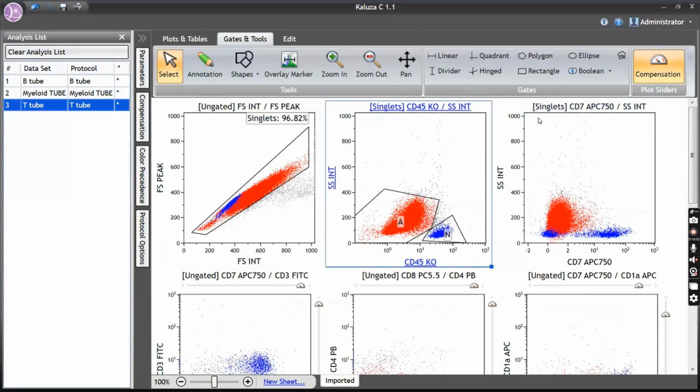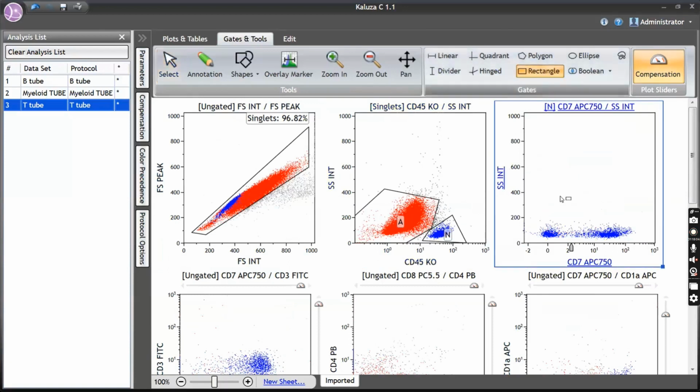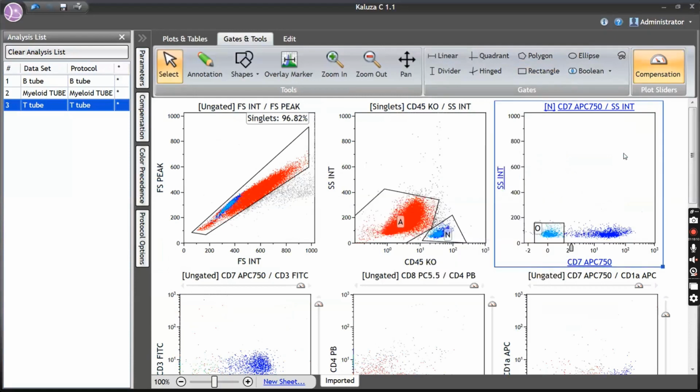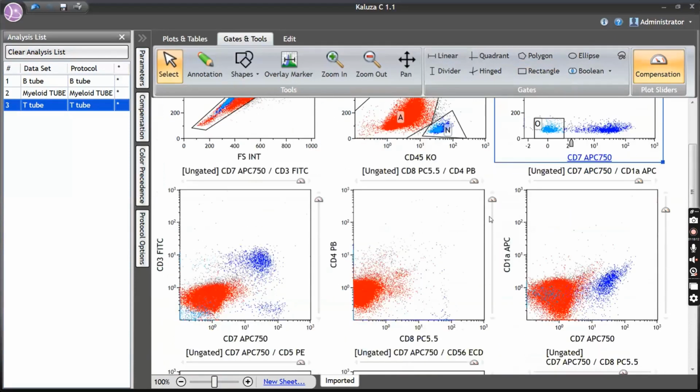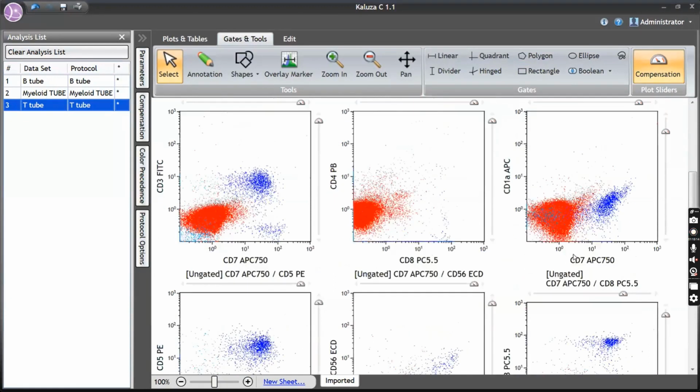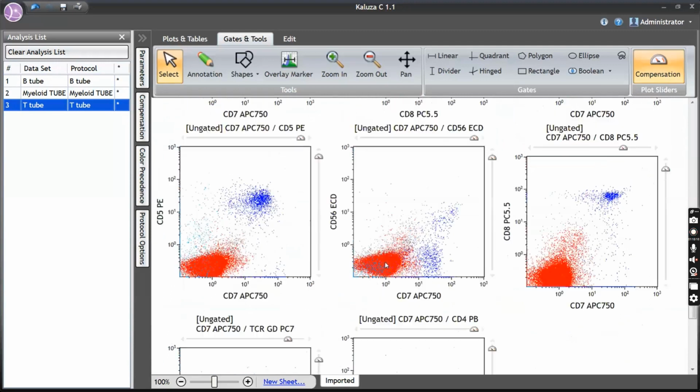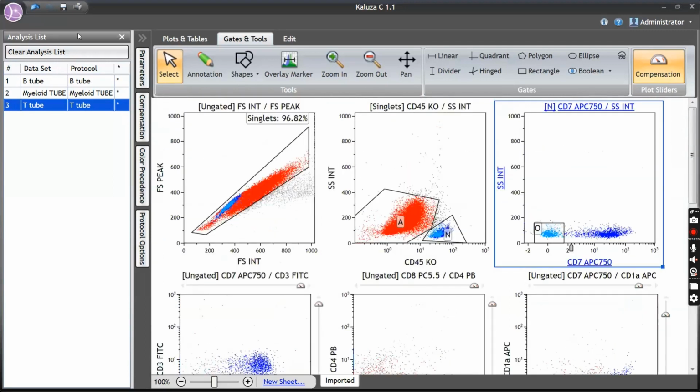So I was using this, so let me use that. So then I will get this. These are B cells likely because CD7 negative. Okay. So now you see there is an internal and negative control, and you see almost the blast is occupying the double negative quadrant. So it is negative for all the T cell markers. Okay.